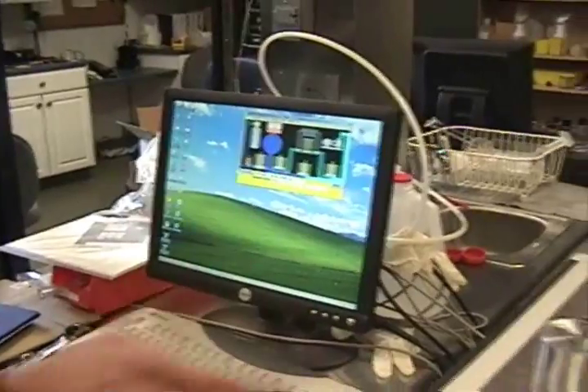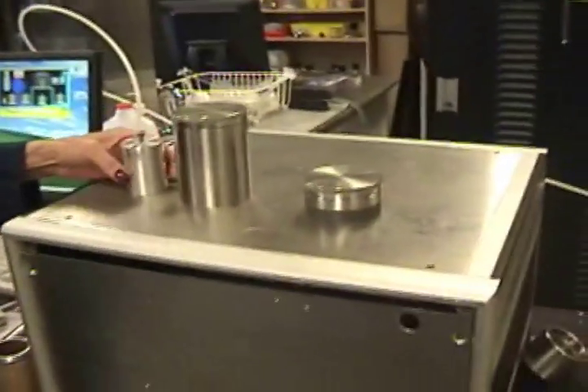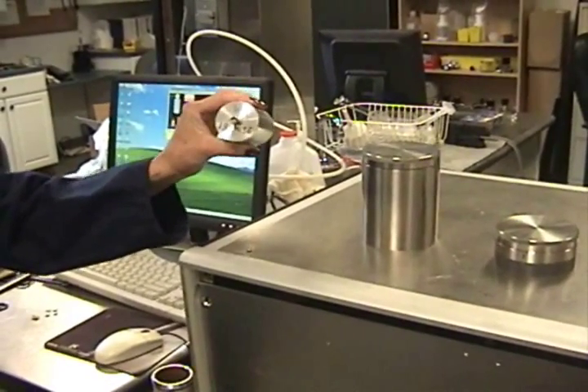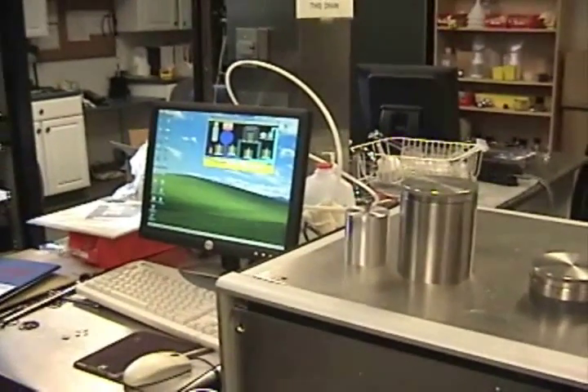It's going to run through the calibration of the internal volumes. Then later, it's going to ask you to insert a slug of known volume. We'll do that later. It's probably about 20 minutes.